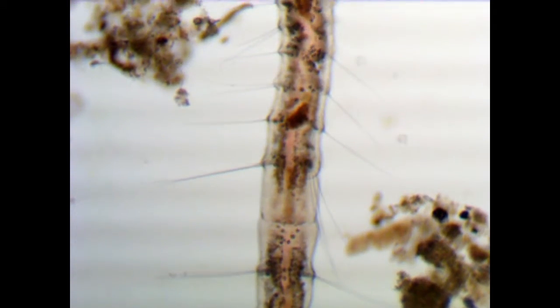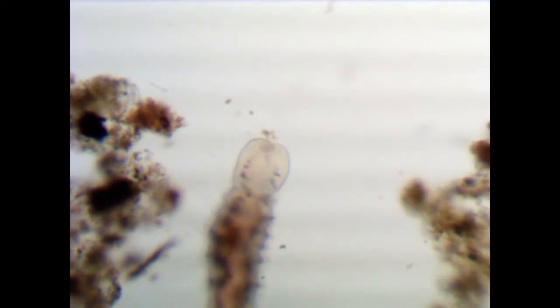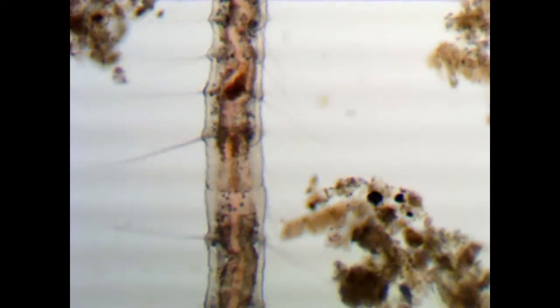But lastly here, I'm going to allow a slow sort of look into the organism, so anybody who wants to take their hand at IDing it can do so. Again, it's fresh water. The organism is rather small, but you can definitely see it without any magnification. I certainly could see it on my slide. It is somewhat translucent. It appears to be eating detritus. It has very long setae, and it's got a little proboscis nose. So anybody who wants to take a crack at it, feel free.